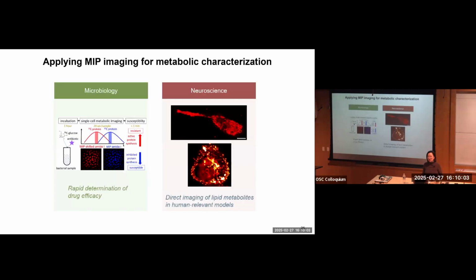So with this concept, I will introduce two important applications for metabolic characterization. The first one is in microbiology. The second one is in neuroscience. For microbiology, I'm going to introduce the rapid determination of drug efficacy, or more specifically, determining whether the antibiotic is working or not.